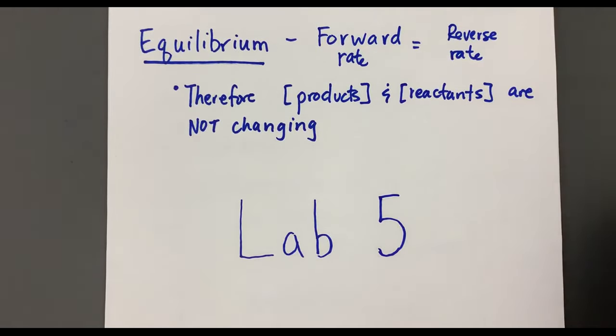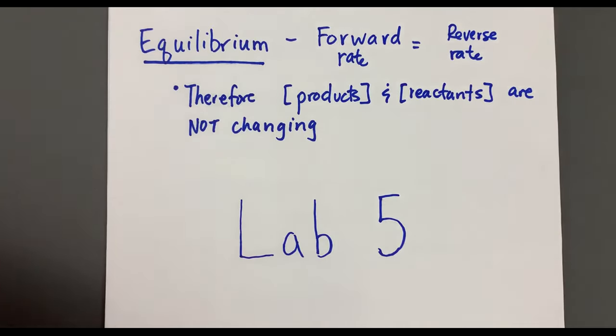All right, welcome to Lab 5 on Le Chatelier's Principle. We're going to be looking at a reaction and seeing how to apply Le Chatelier's Principle to this equilibrium reaction. All right, so to begin with, we should define what equilibrium is.